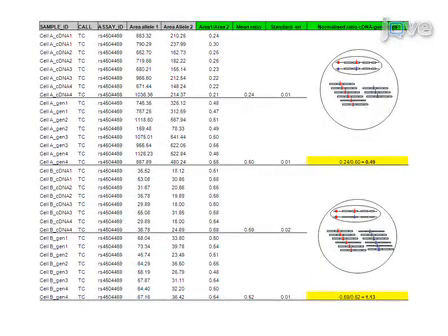Statistical analysis is conducted by extracting the allelotyping report within the mass array typer software. This report provides data about the peak area, and we show here an example relative to 2 cell lines, cell A and cell B, heterozygous for a coding SNP, but where only cell A is heterozygous for a disease-associated marker. The columns labelled in grey are directly generated by the software, while columns labelled in green are derived manually. For each cell, there are 8 measurements for both the cDNA and the genomic DNA.